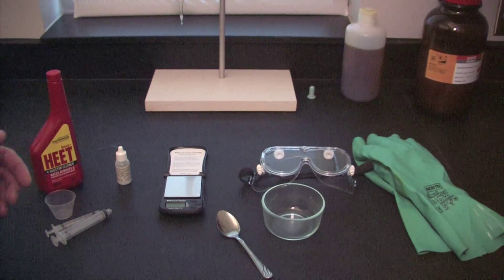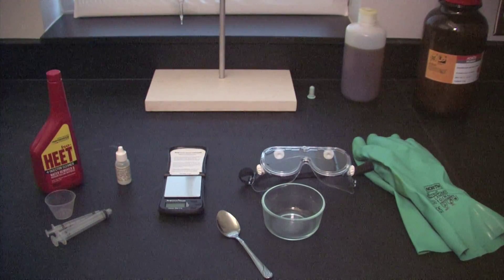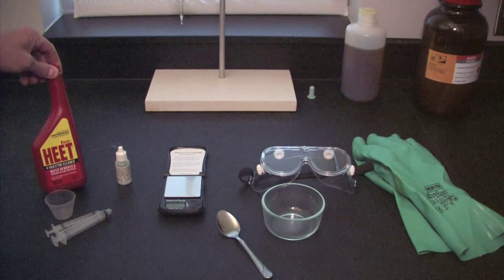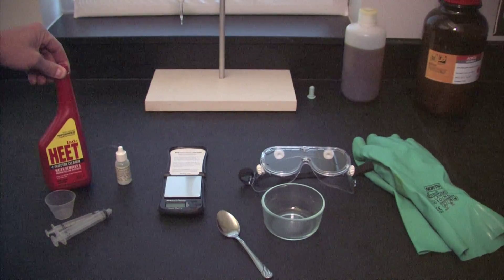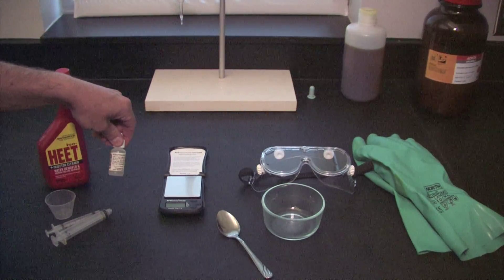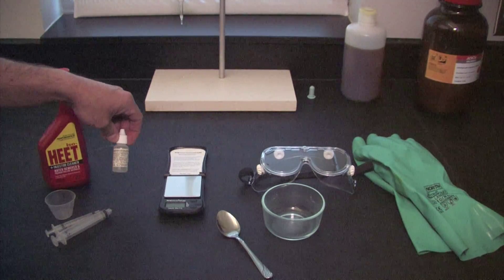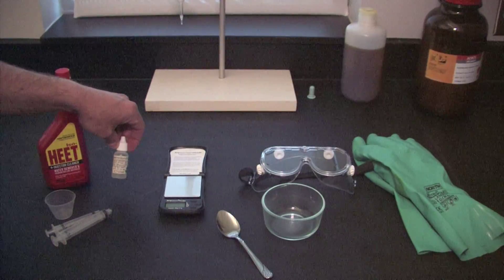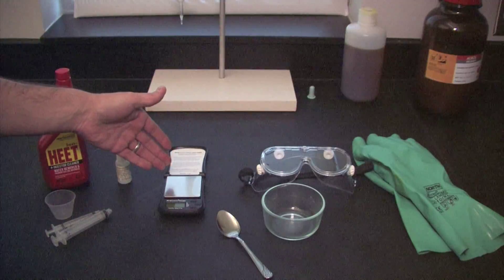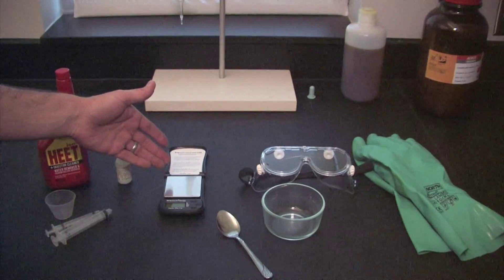First of all we have our protective equipment — our goggles as well as our gloves. We've also got some chemicals which includes this iso heat, which basically contains isopropanol, and that's what we're going to use in the titration process. We've also got a phenolphthalein indicator, which is going to allow us to determine when we've neutralized all of the acidity in our oil feedstock. Next we've got a small scale, and we're going to use that to weigh out the amount of oil feedstock that we're titrating.